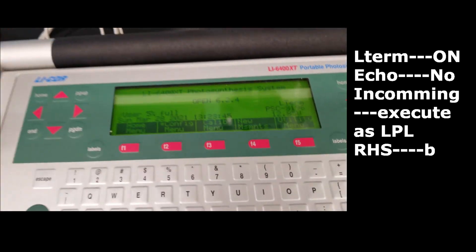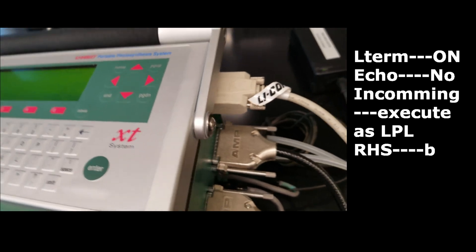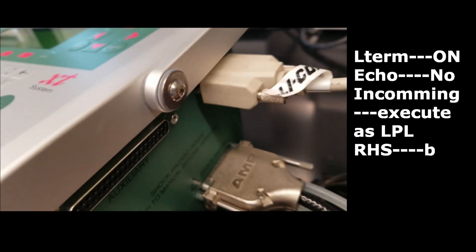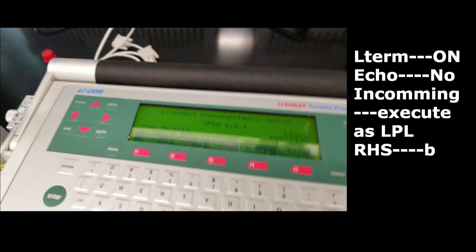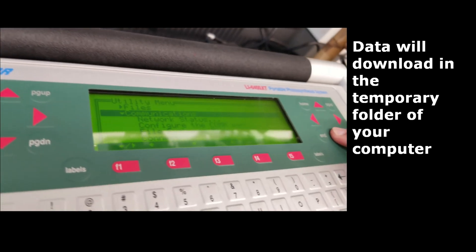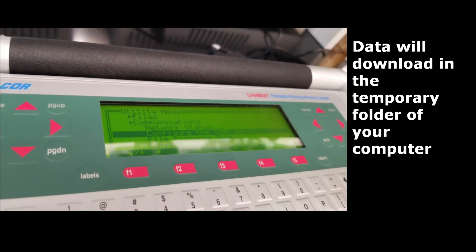To download the data, connect the LiCor to the computer using the RS-232 connection on the console and the appropriate adapter for your computer — either a USB converter or a 9-pin port. You will need to make configuration changes on your LiCor. Open the file exchange program on the computer; when you see the data, double-click it to start downloading. You can also wirelessly collect the data on your computer.